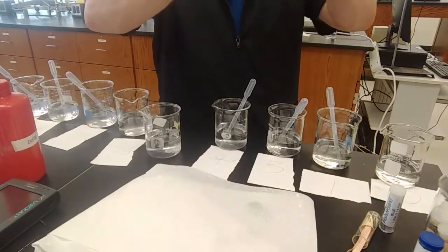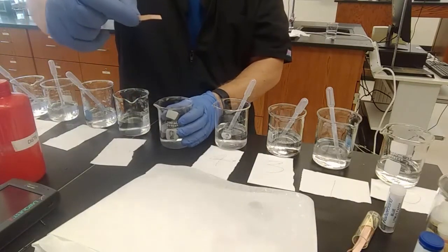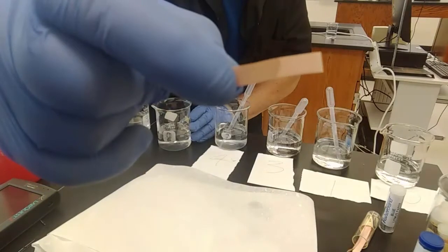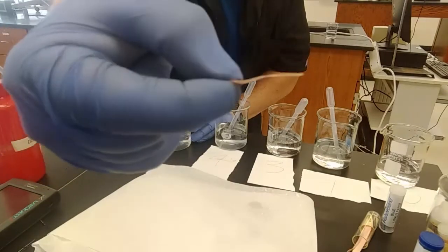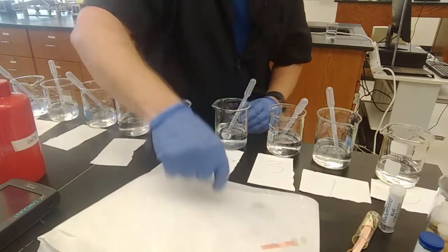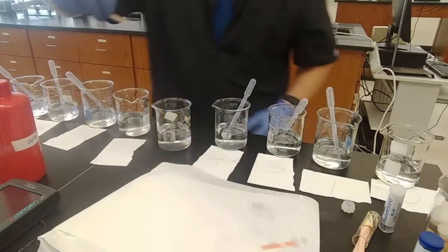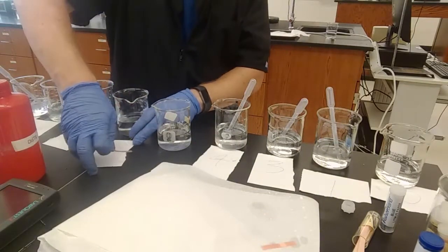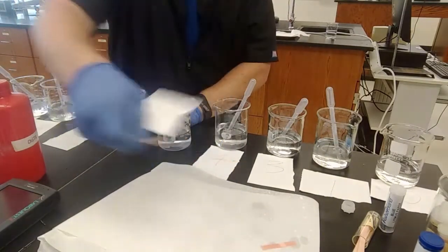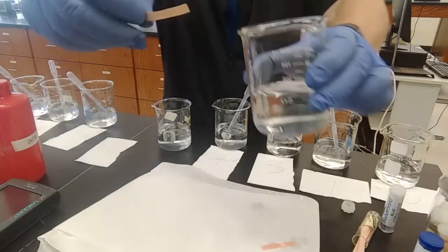Now, exactly neutral shouldn't change, and it doesn't. Okay? No change. Now, here's where we are expecting a change. We should see for pH 10, that's our next one, we should see red litmus paper turn blue.